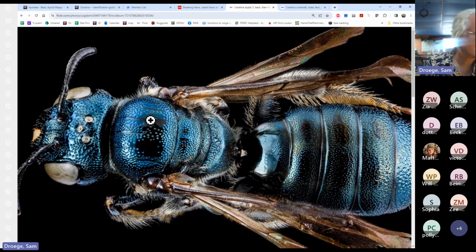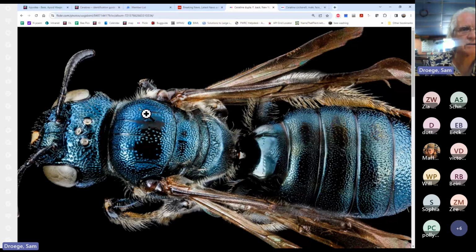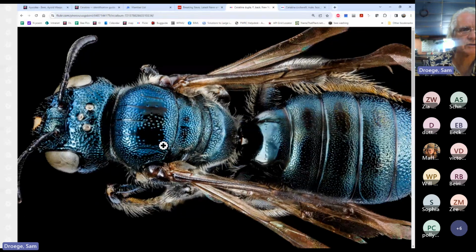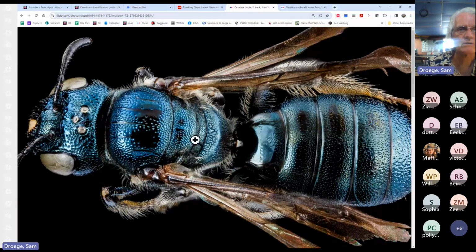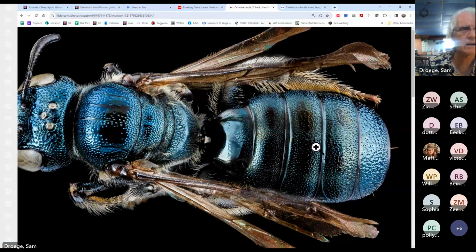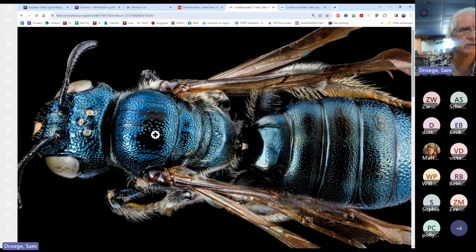You'll see in the other one that we're going to show under the microscope, there's not much, but there is a solid line of pits down along the parapsidal line and some scattered ones there. So this is indicative of dupla, and you can see also the central area.